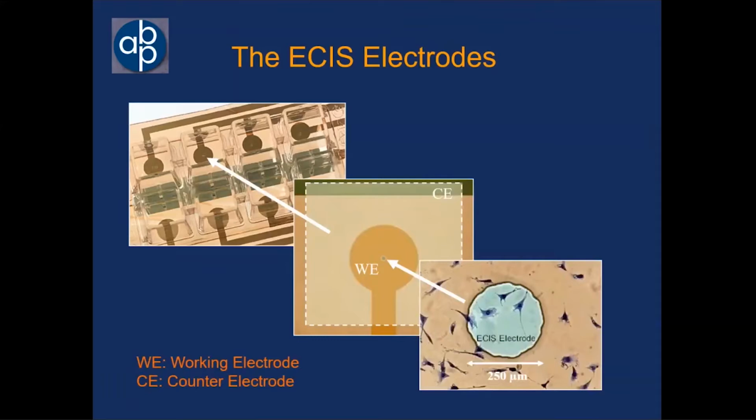The heart of the system, of course, are the special wells that contain the electrodes. In this next slide, you're looking at an 8-well array. You can see the 8 wells in the upper left-hand panel. At the bottom of each well, there is a large counter electrode, which is simply used to complete the circuit. The active electrode is a small 250 micrometer diameter circular electrode.